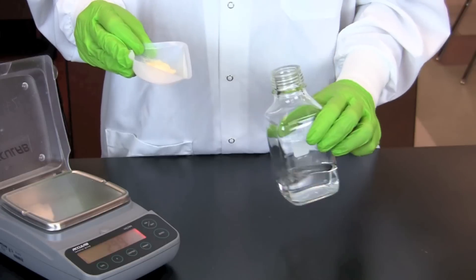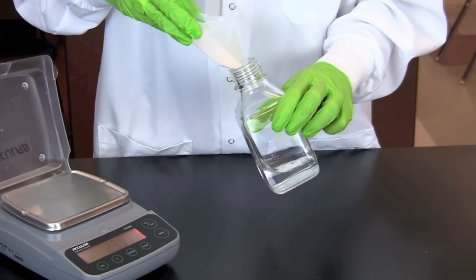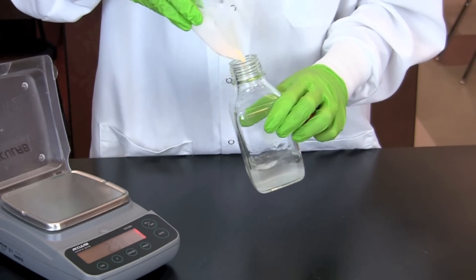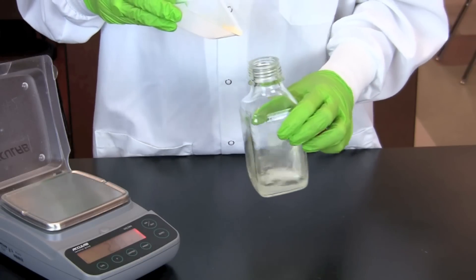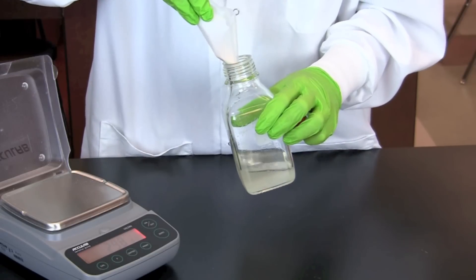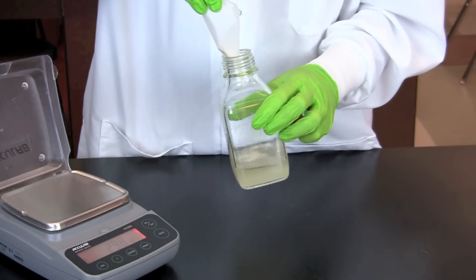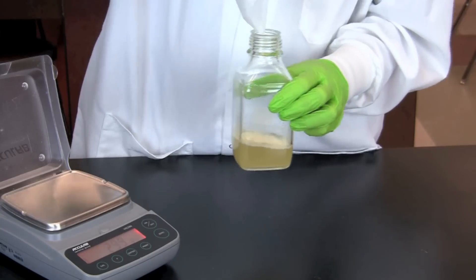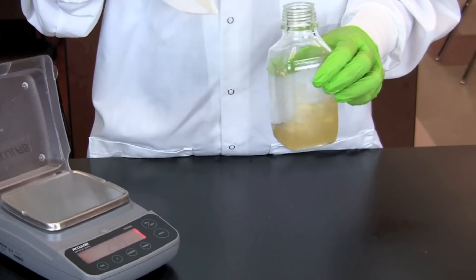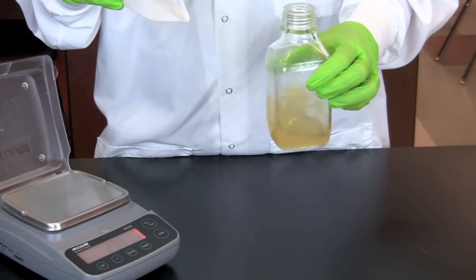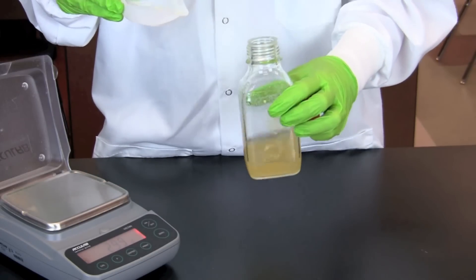The LB agar powder is then added to 100 milliliters of purified water pre-measured in a reagent bottle. The powder is added slowly while constantly swirling the bottle. Swirl until no clumps are present. When finished adding the agar powder, the solution will appear cloudy since the powder is not completely dissolved.